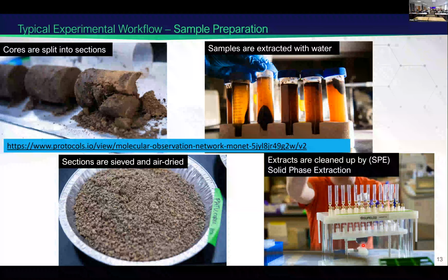Anyone with any chemistry knows that like dissolves like. And so if we use water to extract organic matter, we're only going to extract a certain fraction of the organic matter, which is soluble in water and isn't so tightly bound to minerals that it doesn't go into solution. Different solvent extractions will give you different results. And so it's important to keep that in mind, again, in the context of your original experimental question.